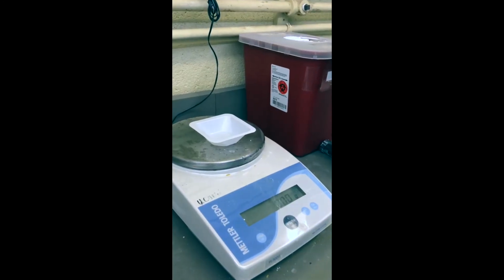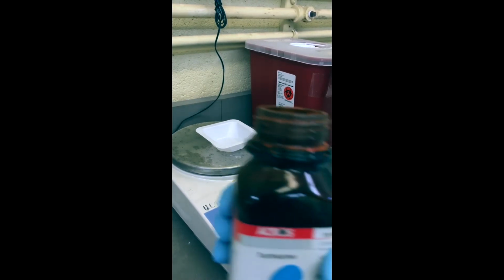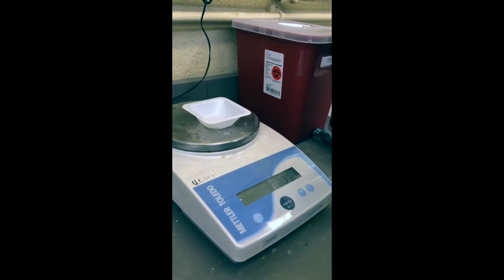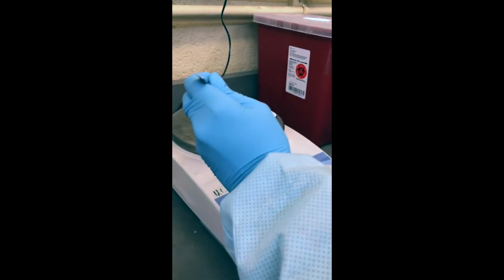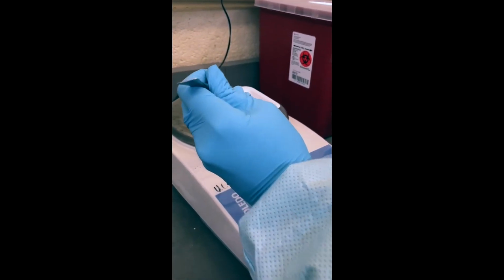The first step of this experiment was to produce the solutions that we would be using throughout the lab. There were 3 different solutions that we had to prepare for this experiment. The first was a 1-liter solution that was 0.5 grams per liter tartrazine. We made this by measuring out 0.5 grams of tartrazine and adding it to 1 liter of water.